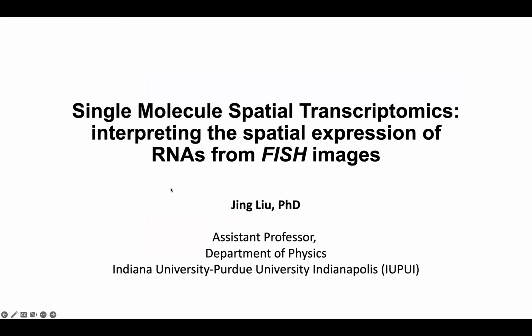The first thing I want to do is acknowledge dkNET for the support on this research topic that I'm going to present today. This is the first grant I received on this topic, although I was working on RNA imaging for a really long time. Today's talk is typically about an extension of the pretty emerging tools called spatial transcriptomics, but we are trying to interpret the data and develop a new concept of biophysics, a biophysical interpretation at the single molecule level.